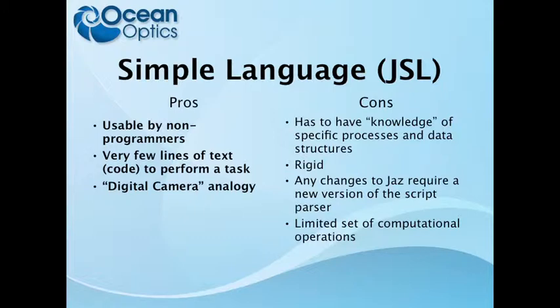So if you're going to get a spectrum, you just have one line to get a spectrum and where you want it to be put. If you're doing it in another language, you may have to go through 4, 5, or 6 different commands to set different things up. Well, we set that all up for you.